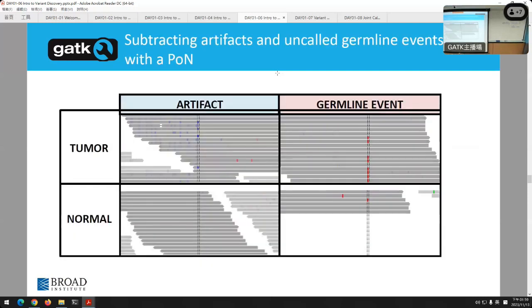And here's an example of an artifact. Okay, you can see in these, through the genome, things that can trick a variant caller. They're just not great sequencing. I'll say about IGV, we mentioned that when a base is different than the reference, it has a color, but the intensity of that color is proportional to the confidence, the quality score. So if it's a Q40.